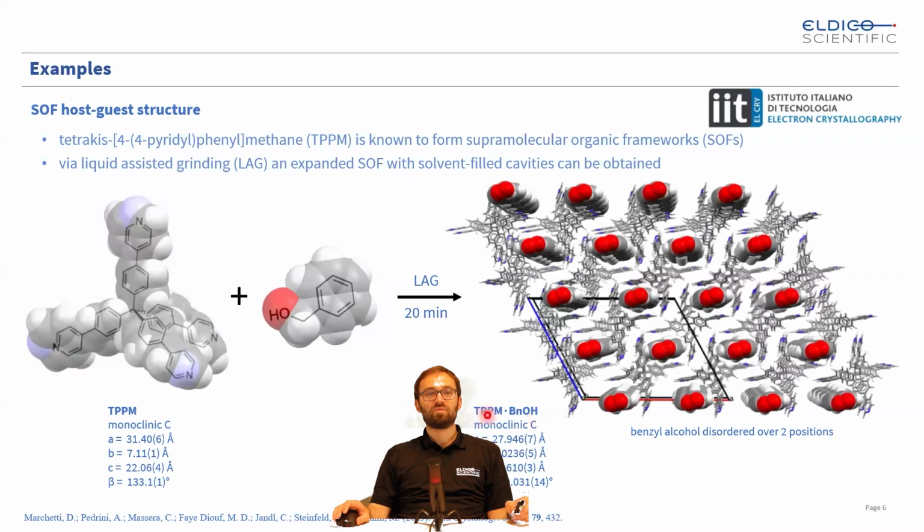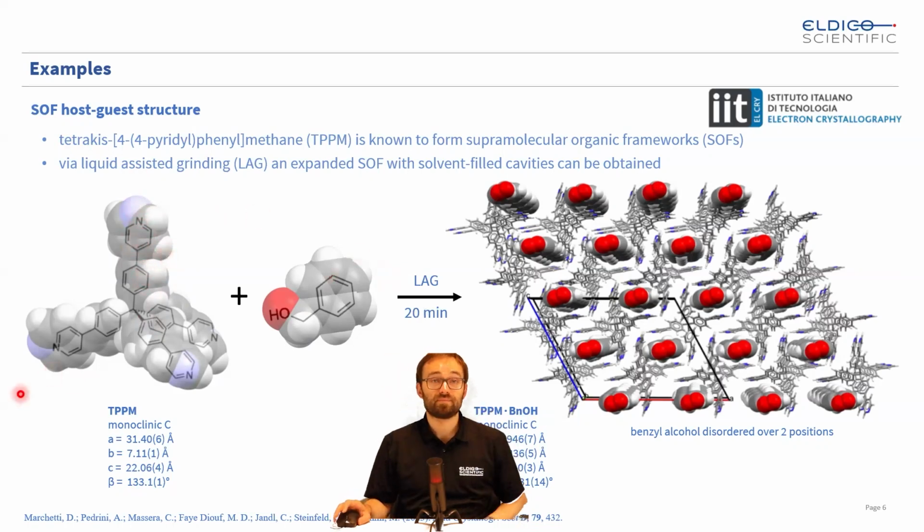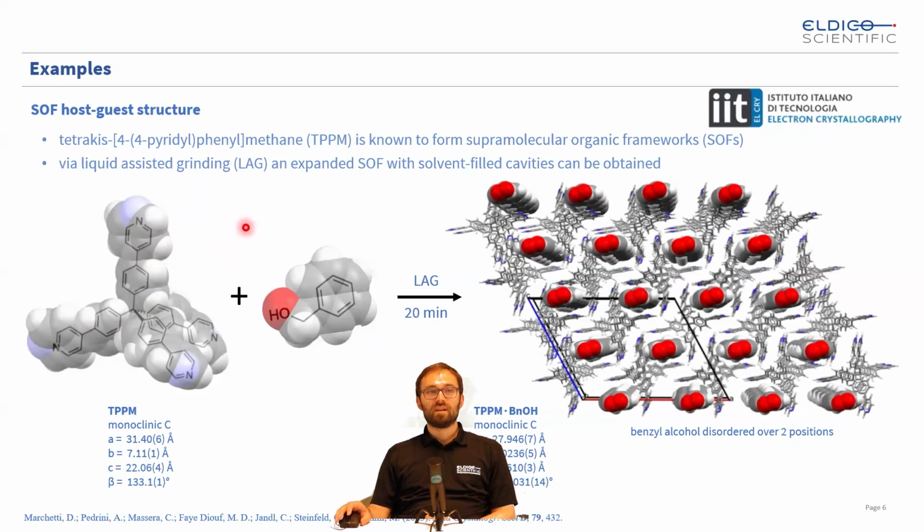Now to some real examples. So here we have a supramolecular organic framework based on this tetrakis pyridyl phenylmethane. So the empty framework is already known, and what our collaboration partners did is fill it with a solvent, in this case benzyl alcohol, by liquid assisted grinding. You see, it's a very fast reaction, just performed within 20 minutes.